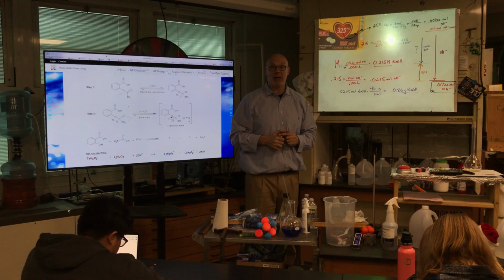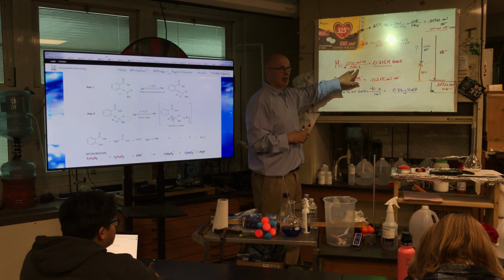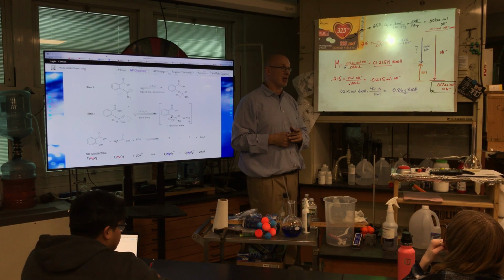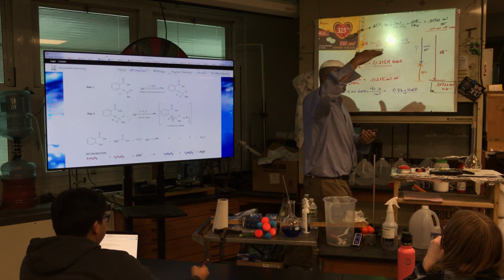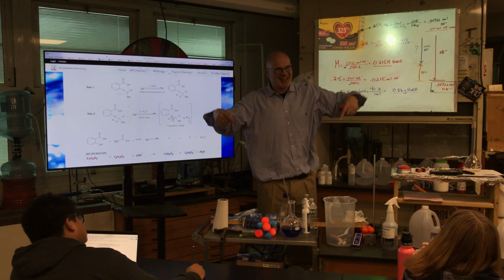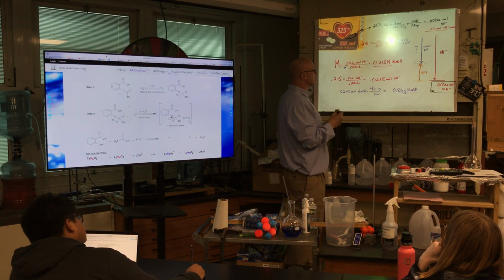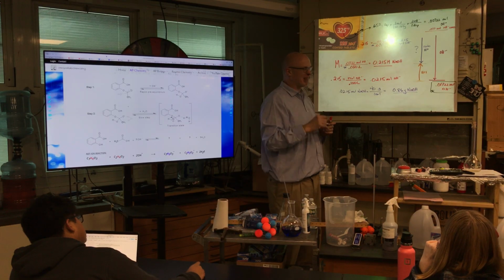Why am I picking 10 milliliters? Because we have an extra of 20. I could pick 5, but I'm gonna pick 10. This is a standardization, yes. All right. So in any case, we are arbitrarily designing this to be 10 milliliters. It's going to be more, but a little bit more.